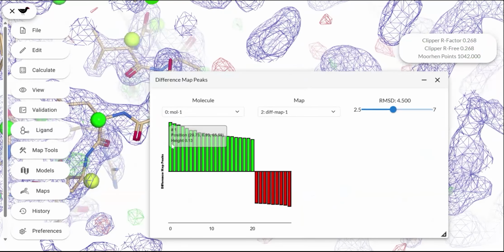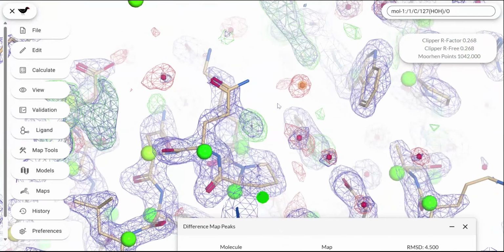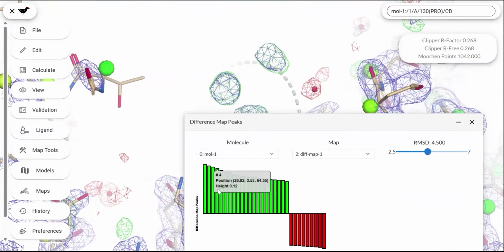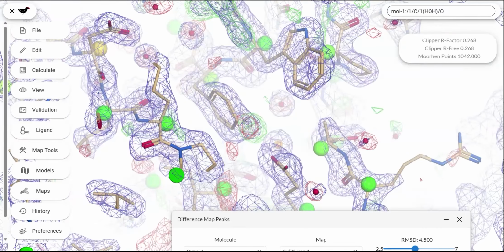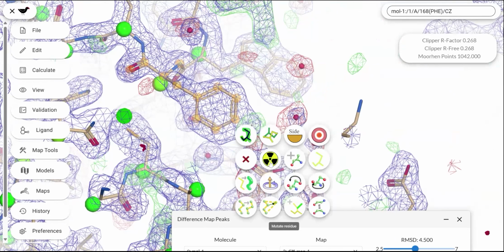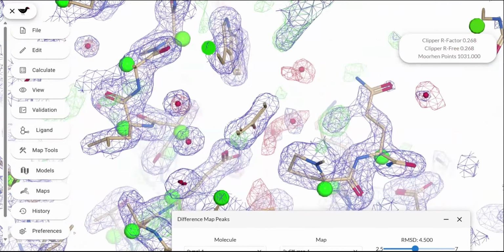Okay, let's actually start over here. So this is the blob where the inhibitor is. We can go back to that later. That might be a water molecule. Maybe, maybe not, or maybe just a sulfate ion. Trying to find additional locations. Okay, so clearly it might just be a tyrosine. Let's go tyrosine. Could be. Okay, so it actually said it may or may not be.